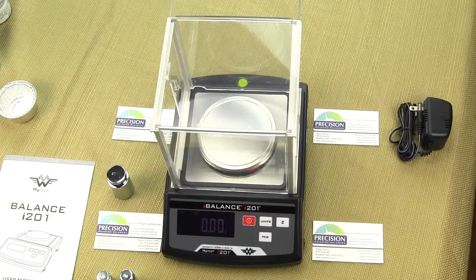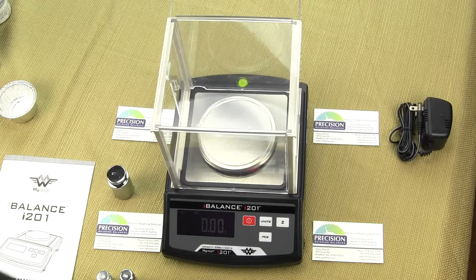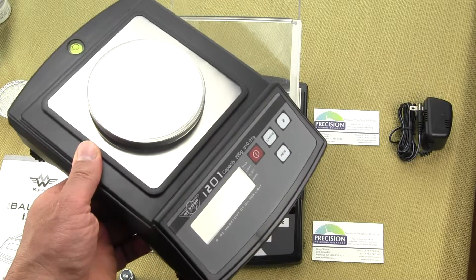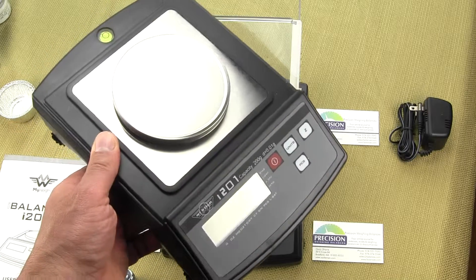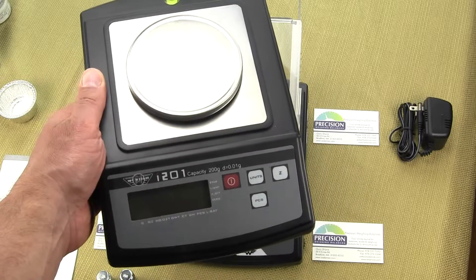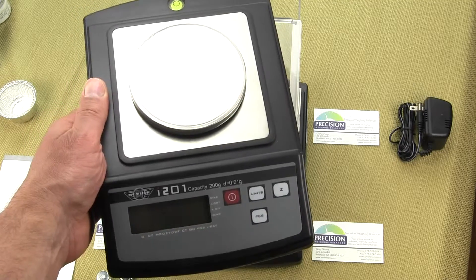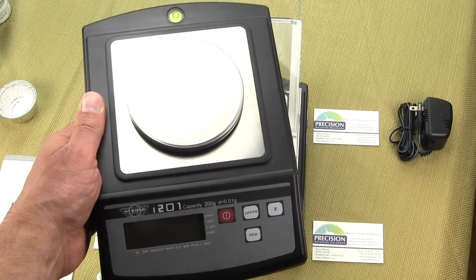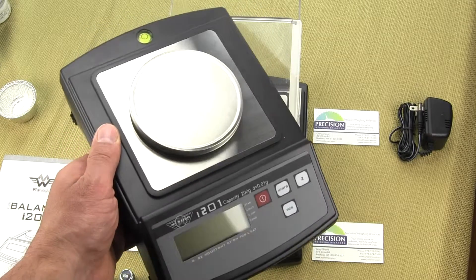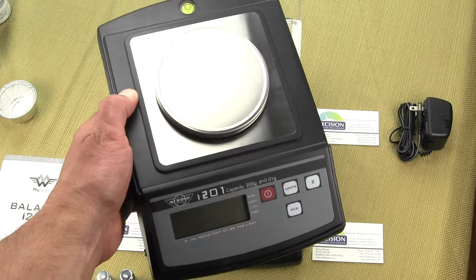This is the new i-201 version 2, and we'd like to show you the old version 1 here. The version 1 had an LCD display, basically the same four keys for the keypad, and it was 200 grams by a hundredth of a gram. So the weighing capacity and readability hasn't changed, but some of the features have. The main difference is the display.